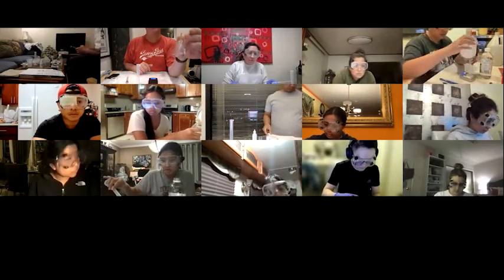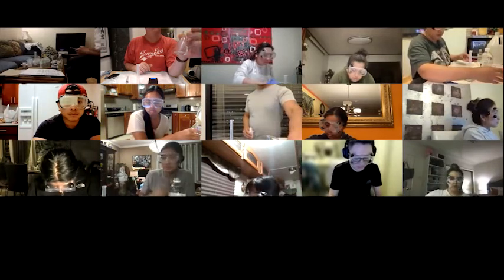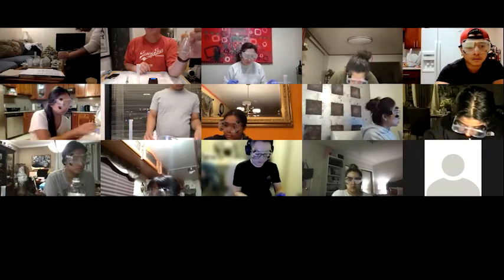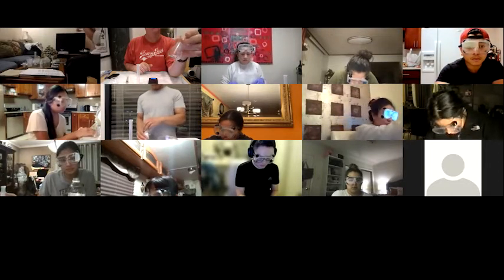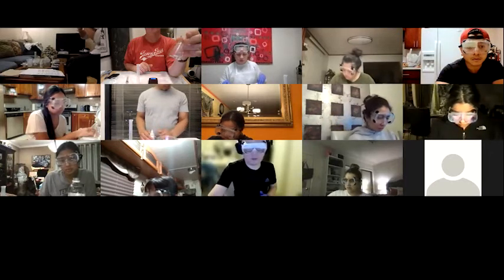What amount of acetic acid are we actually titrating here? What's the unit? Somebody help me. What's the unit of acetic acid we're titrating? It's not volume.